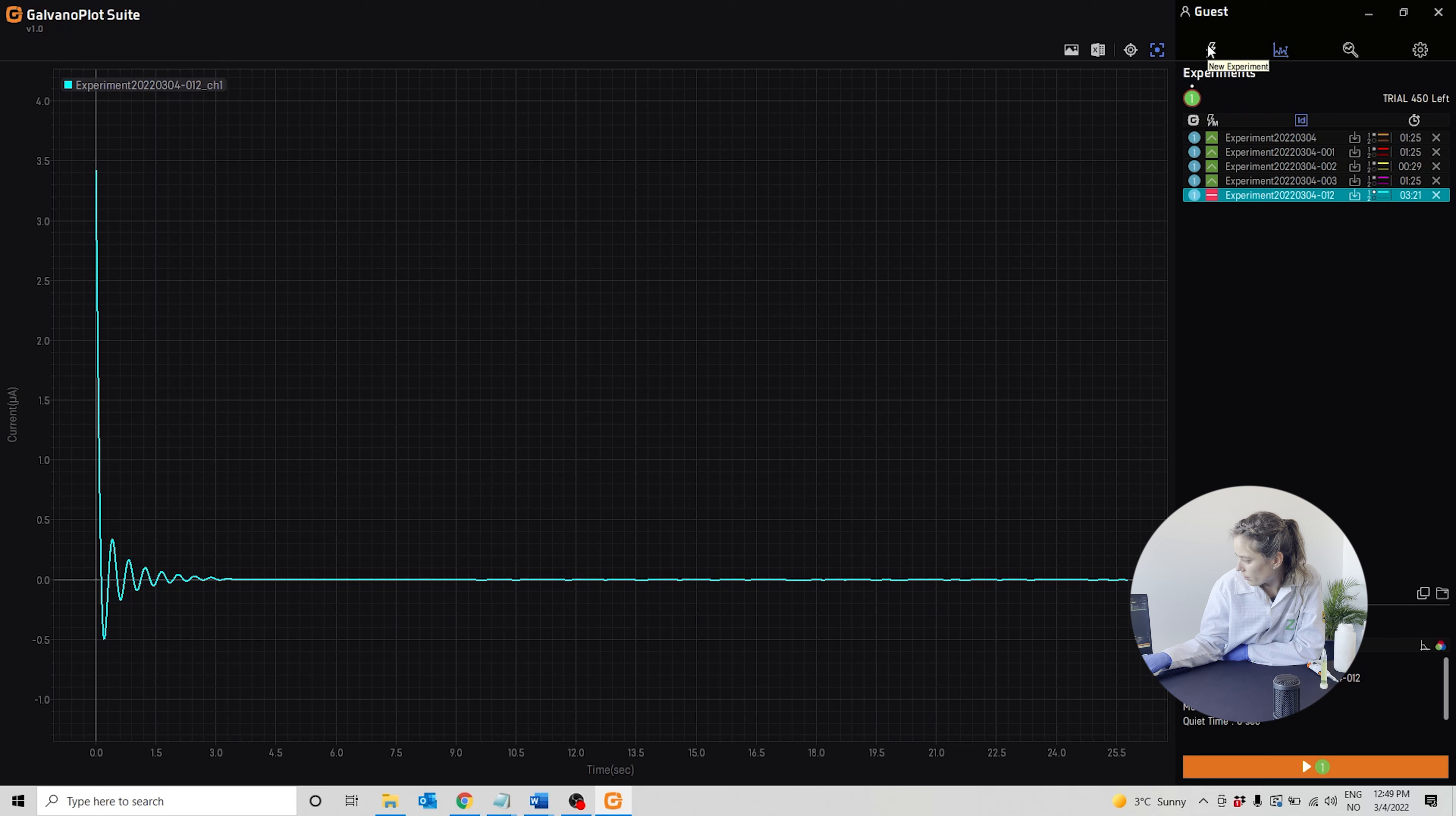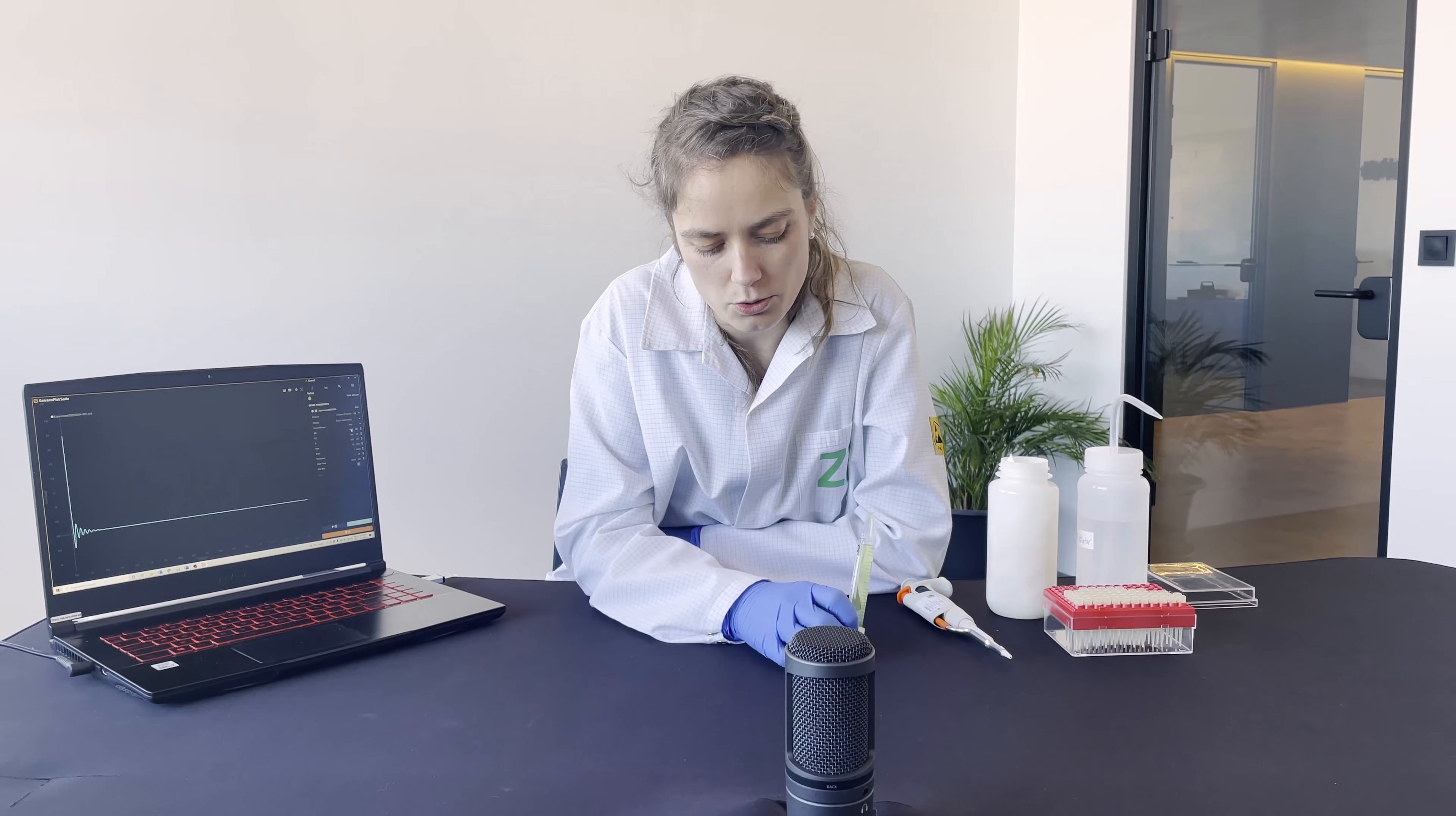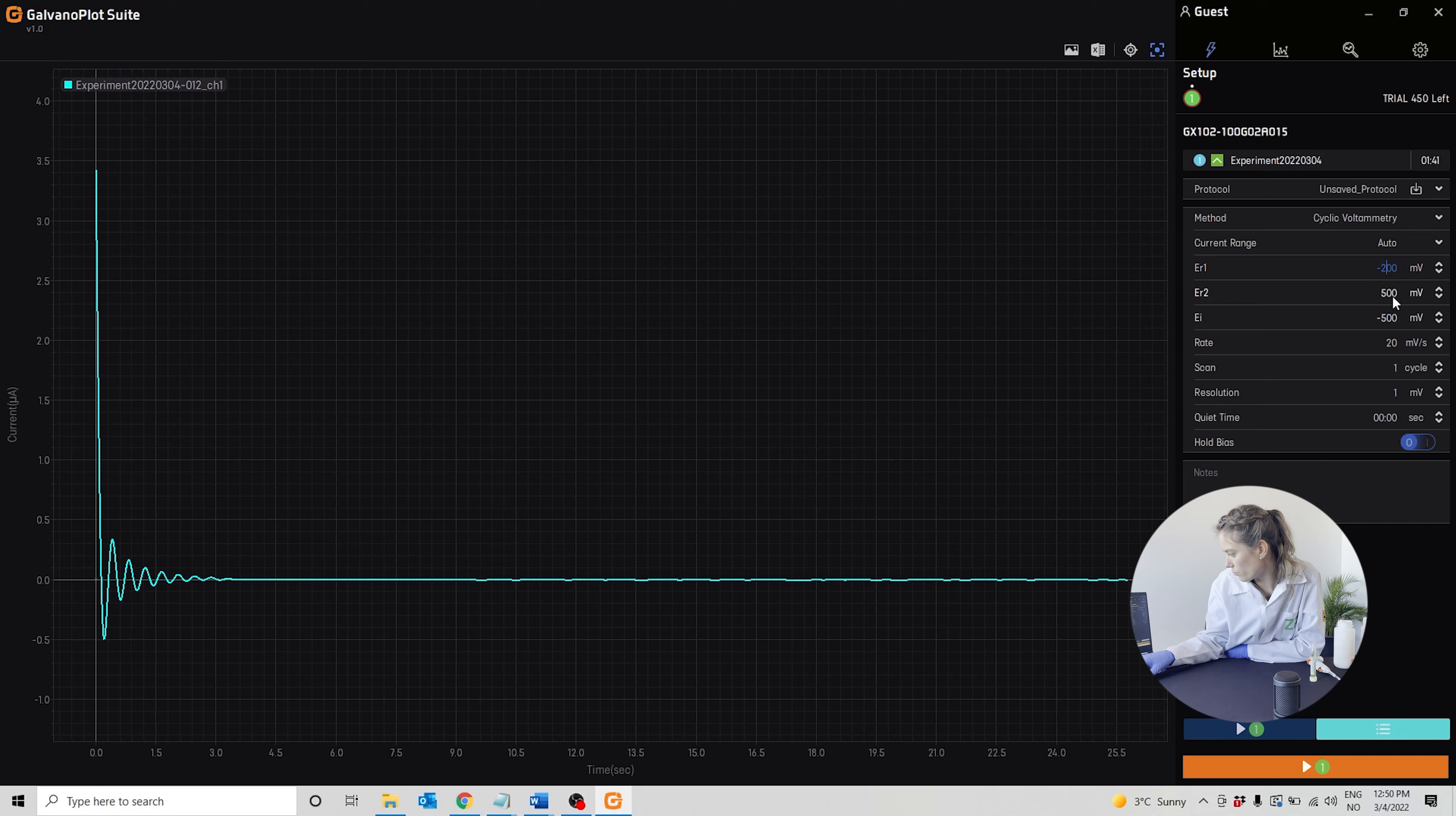We'll make sure the method chosen is cyclic voltammetry. For the cyclic voltammetry of potassium ferri-ferrocyanide solution, we will run from -200 millivolts to 500 millivolts.